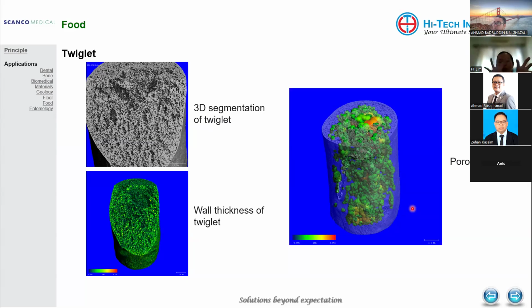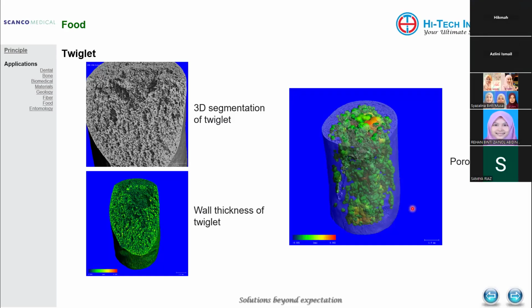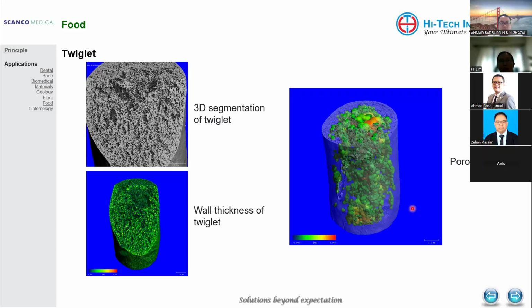Their main purpose is to look at what kind of bread will be suitable for patients who require minimal chewing, or how well it can be digested after applying some acid to mimic the gastric acid, and how fast it can be digested. So these are very interesting research projects where we utilize MicroCT to do all this mimicking, to increase the impact of our research.